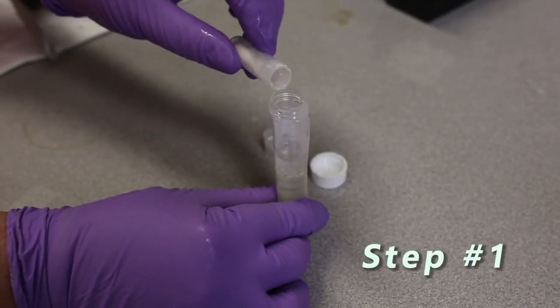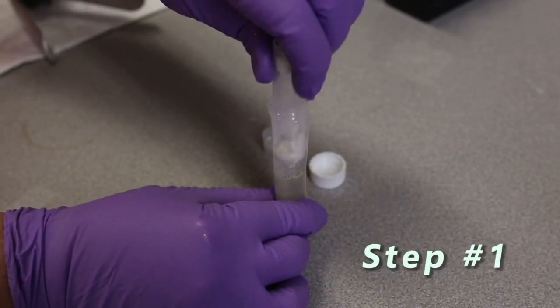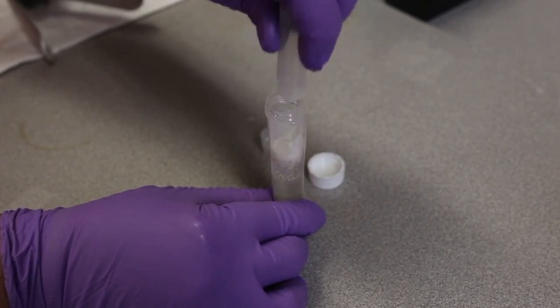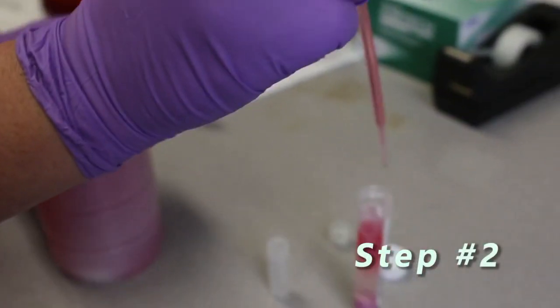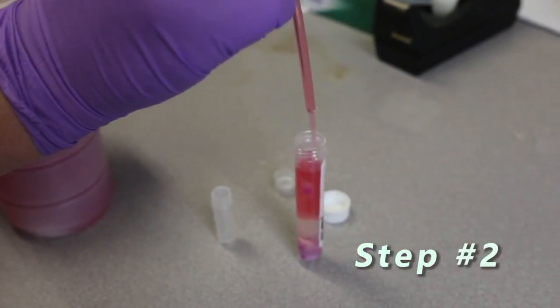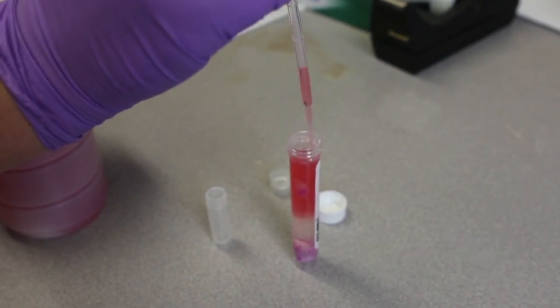Let me show you an example of a water test. Step 1, empty the small tube of dry powder into the 10 milliliter tube. Step 2, fill the 10 milliliter tube with fuel until it's filled to the top of the label.